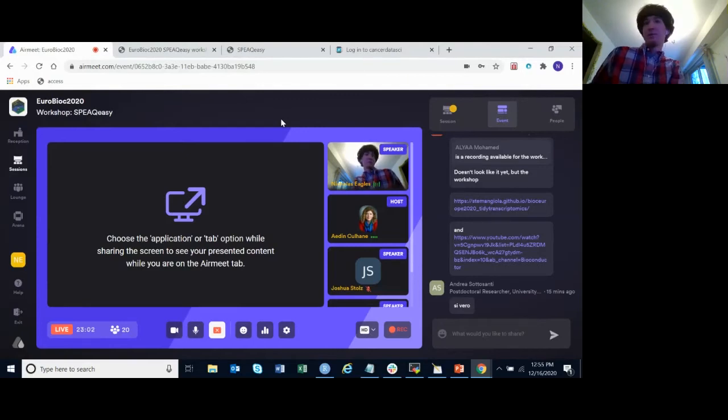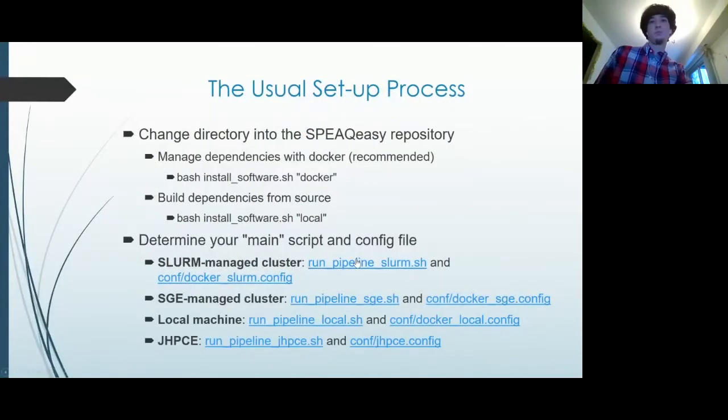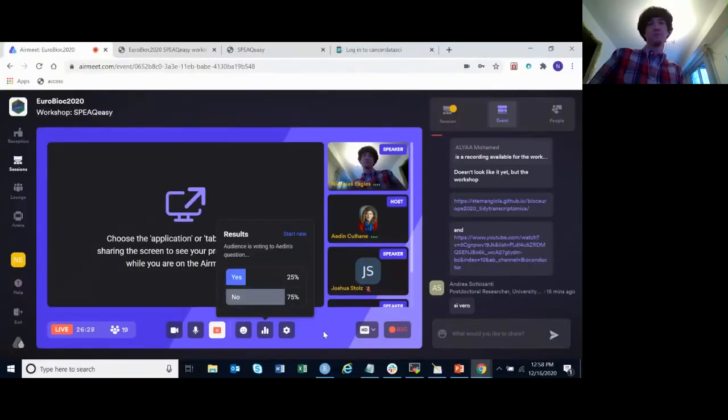I'll give it a few more minutes, and I'll also go through the solution if you want to wait for that. If you want, we could do a quick poll to see if people need more time to do the exercise. Yeah, that'd be great. You want me to do a quick poll on that so you get a better idea? Yeah, that'd be useful. And by the way, if you're following along with the slides, we do include links to things like the config, so that if you're online, instead of cloning the repository, that's an option. There's 75% done. Okay.